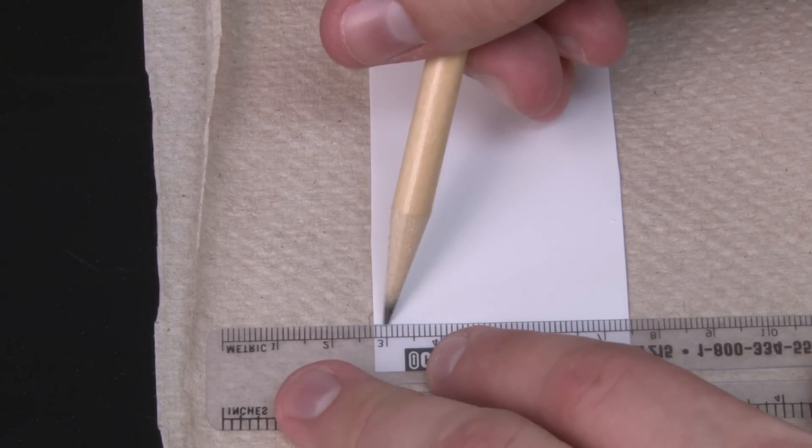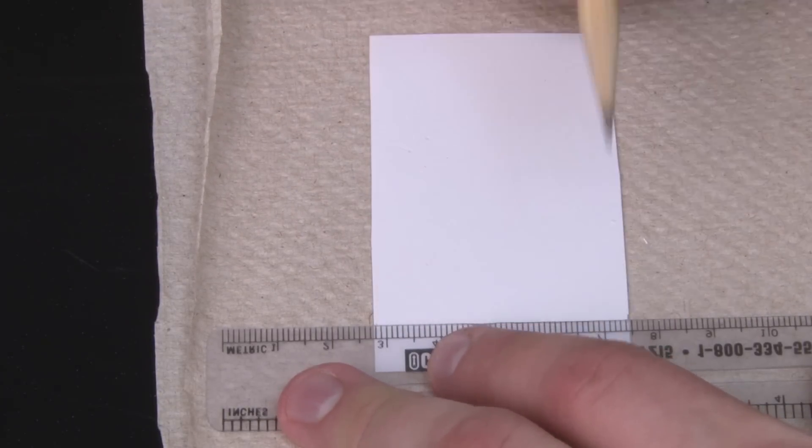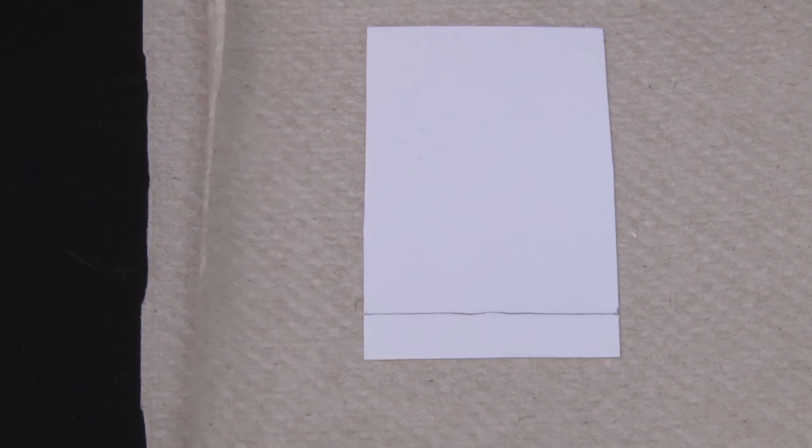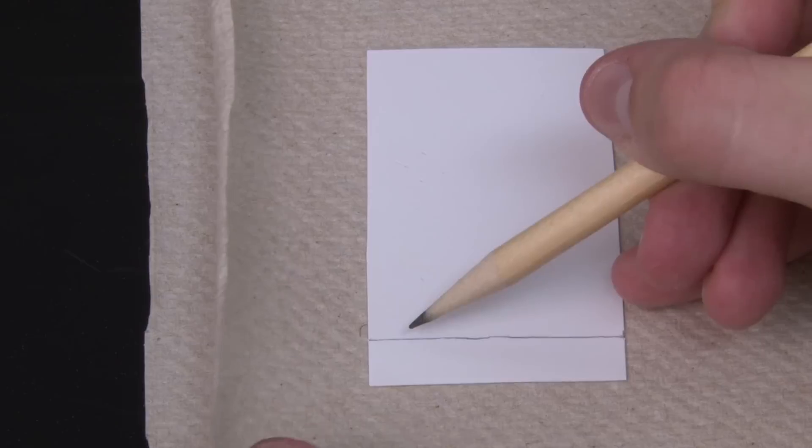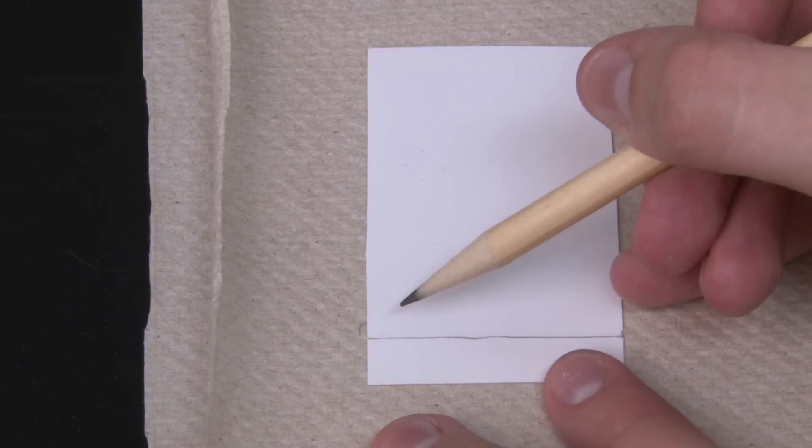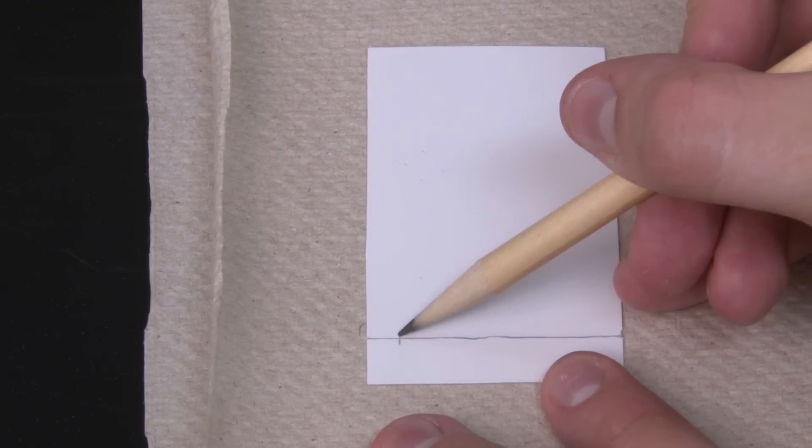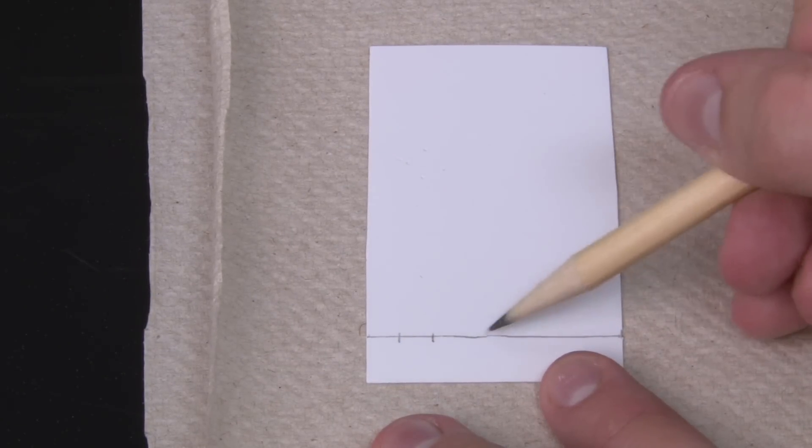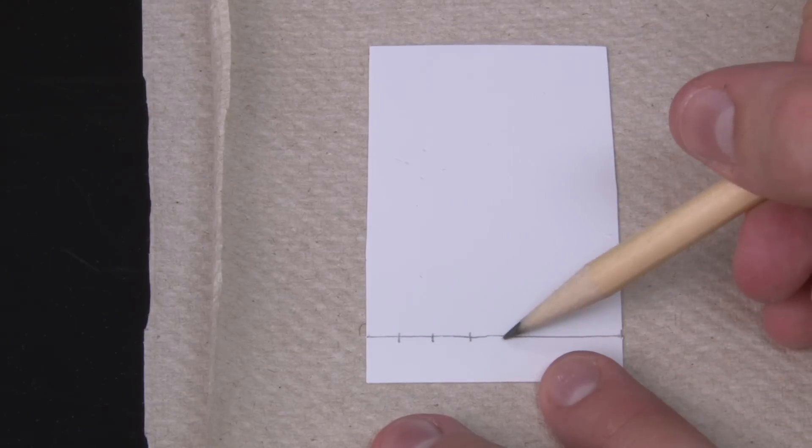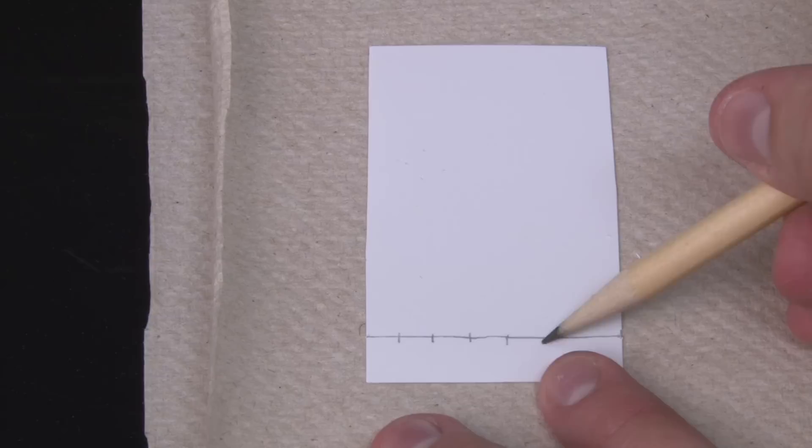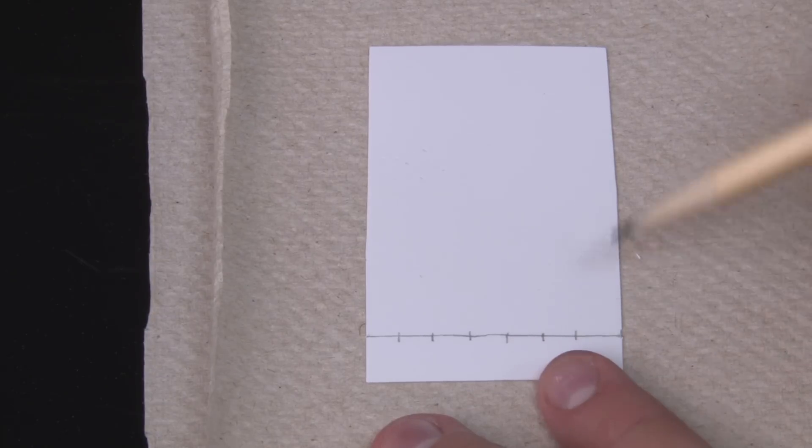Use a pencil to draw a light line on the powdery side about one centimeter from the bottom. Then draw six hash marks evenly spaced along the line, leaving a little extra room on the edges. If your TLC sheets are smaller, your instructor may have you use two sheets. These hash marks are where the samples will get applied.